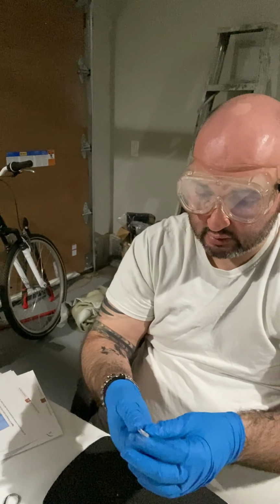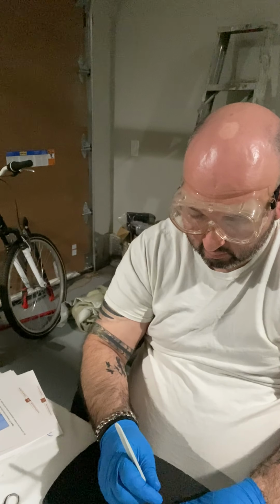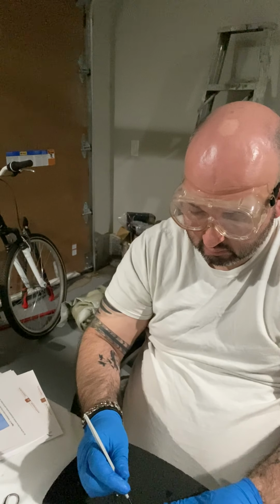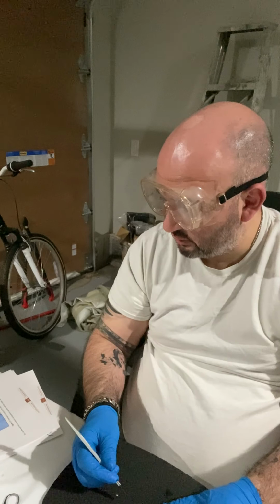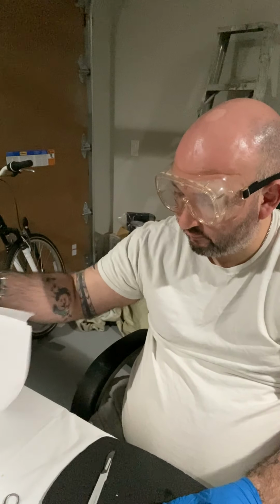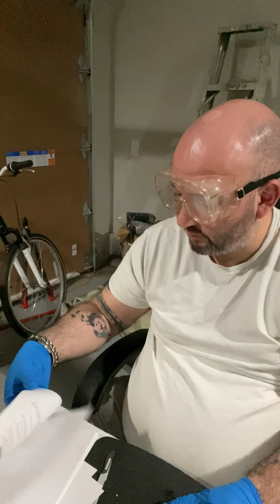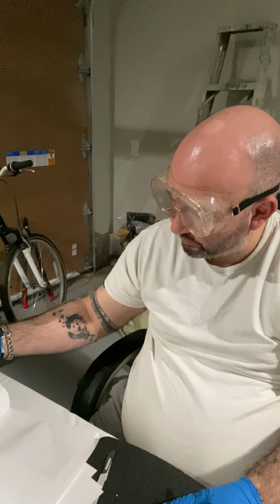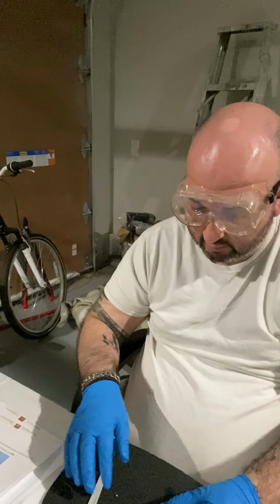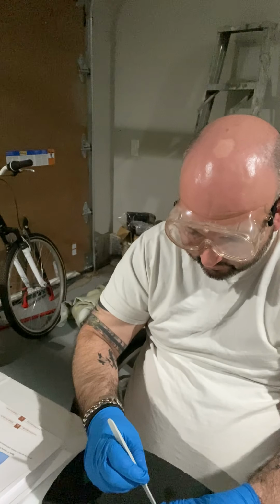So, my trusty scalpel here. And as you can see, there is fluid that just leaked out of the eye, or the eyeball itself, which is expected to happen. Forgive me here. Basically it's just aqueous liquid, fluid that's in there that's leaking out of the eyeball, since I basically just cut right down the center of it.